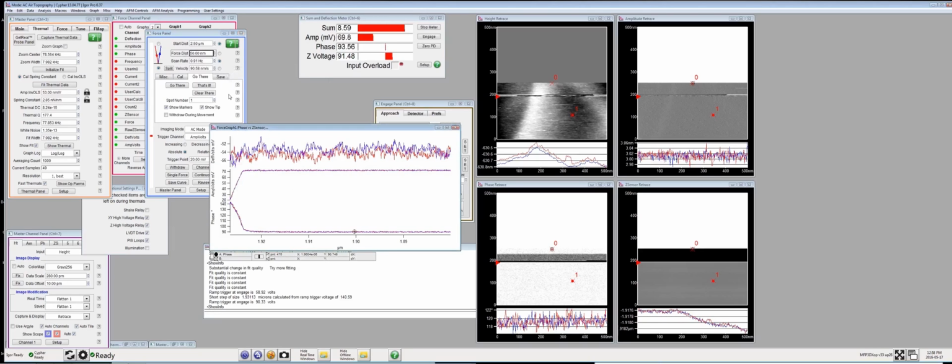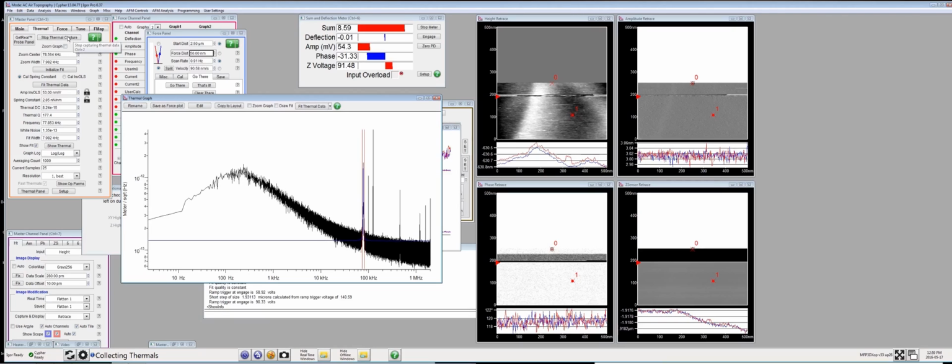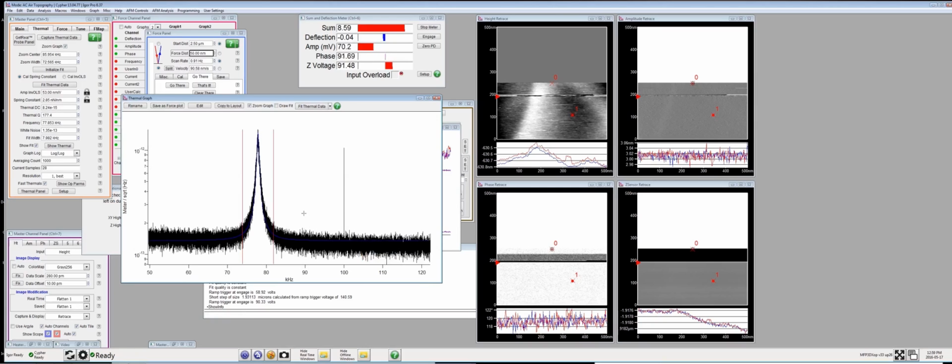So now all that's left is do the capture of thermal. Let's see the panel. Thermal. So this is the new thermal now. We should take approximately 30 to 40 at least, in my experience. So now what I'll do is stop thermal because this is just for exemplifying force acquisition anyway. So I'll stop here and I'll go again and I'll expand. Okay, so this should be the peak now.